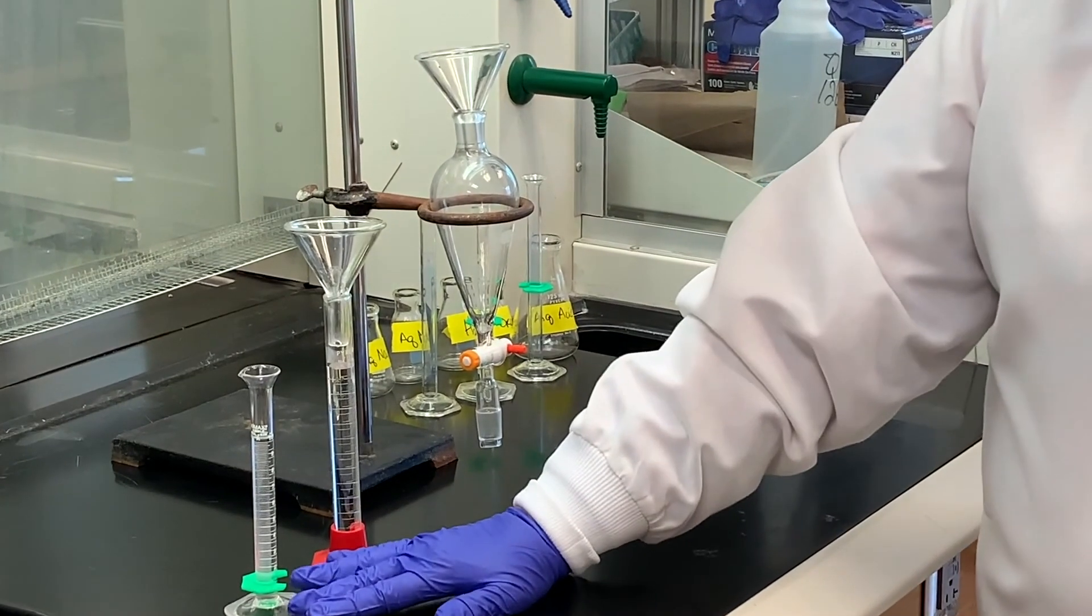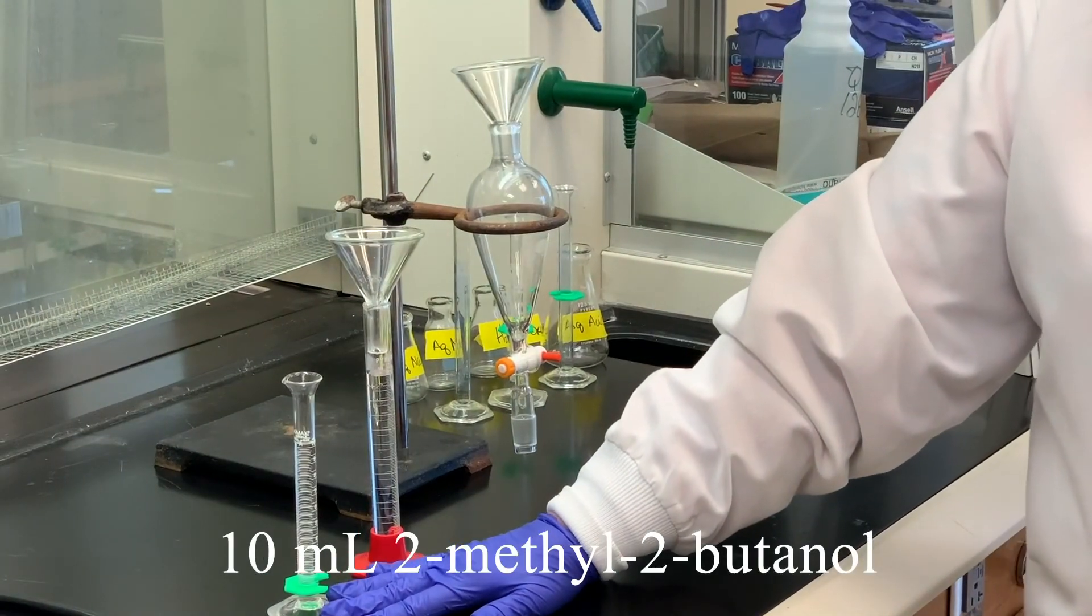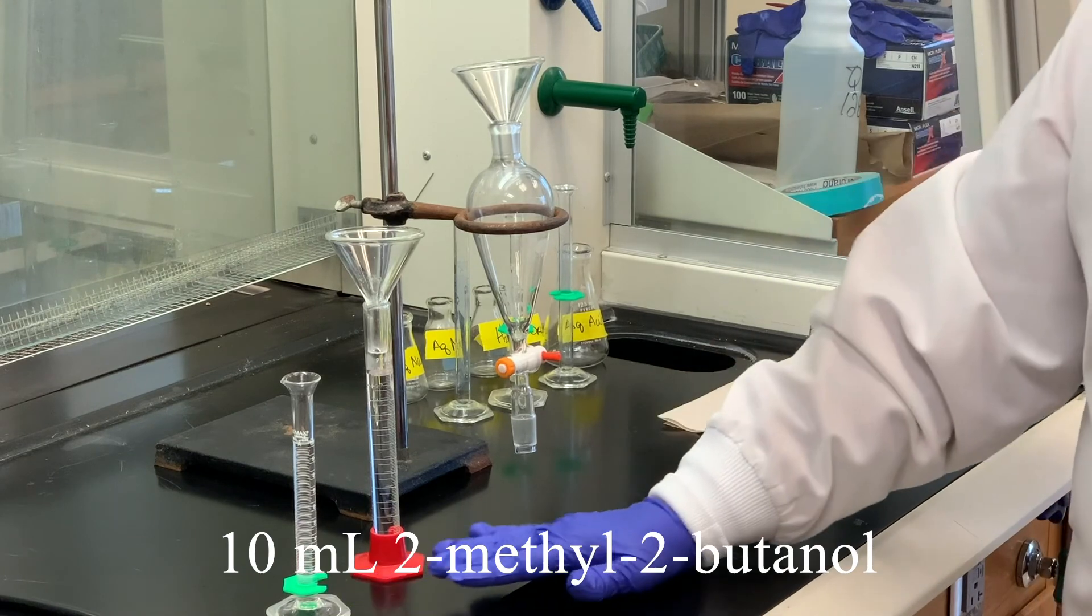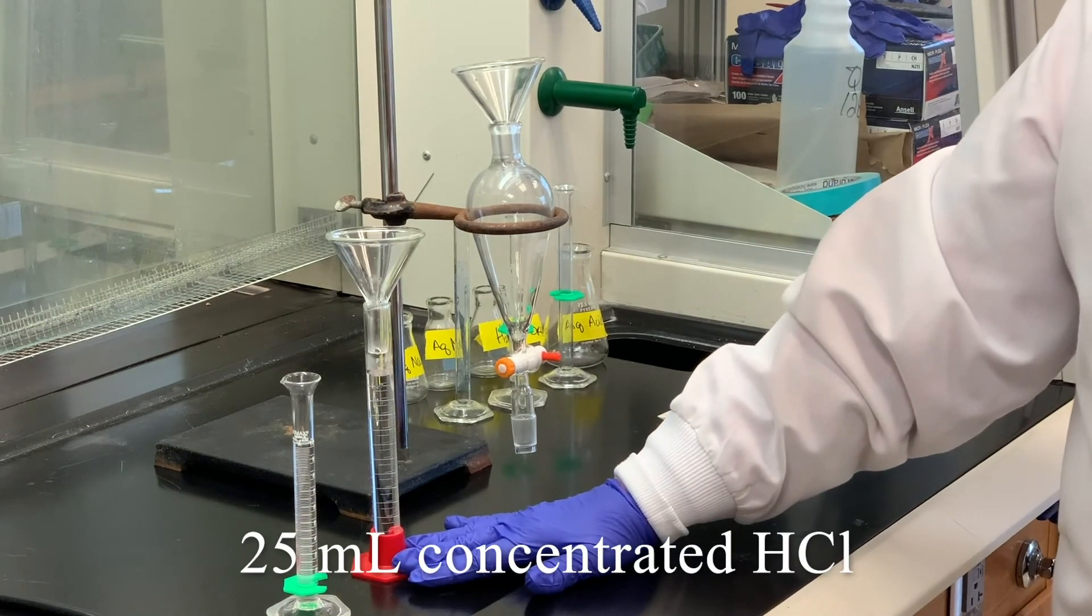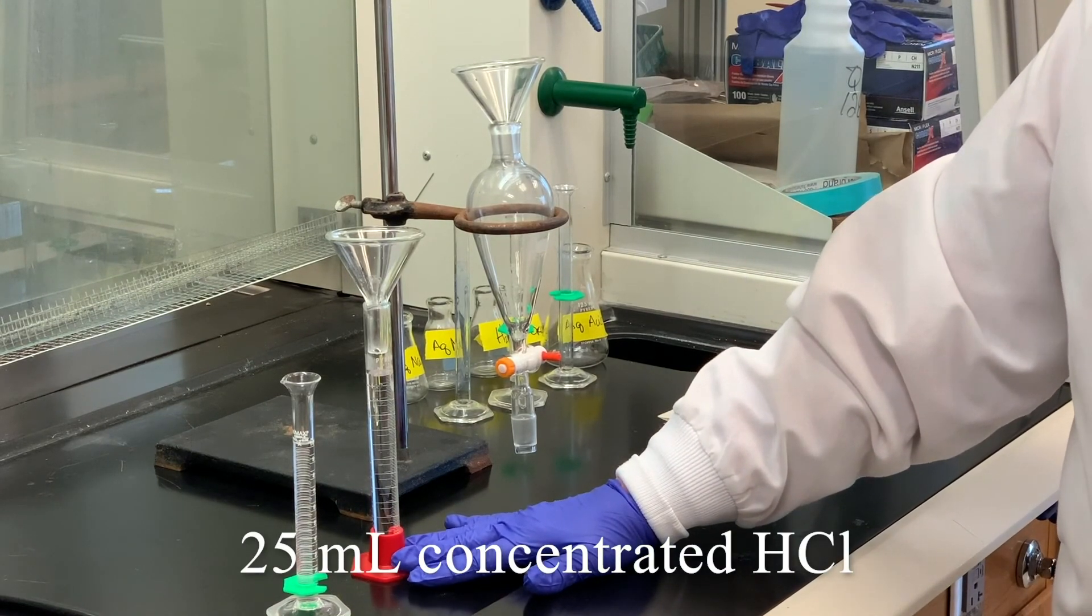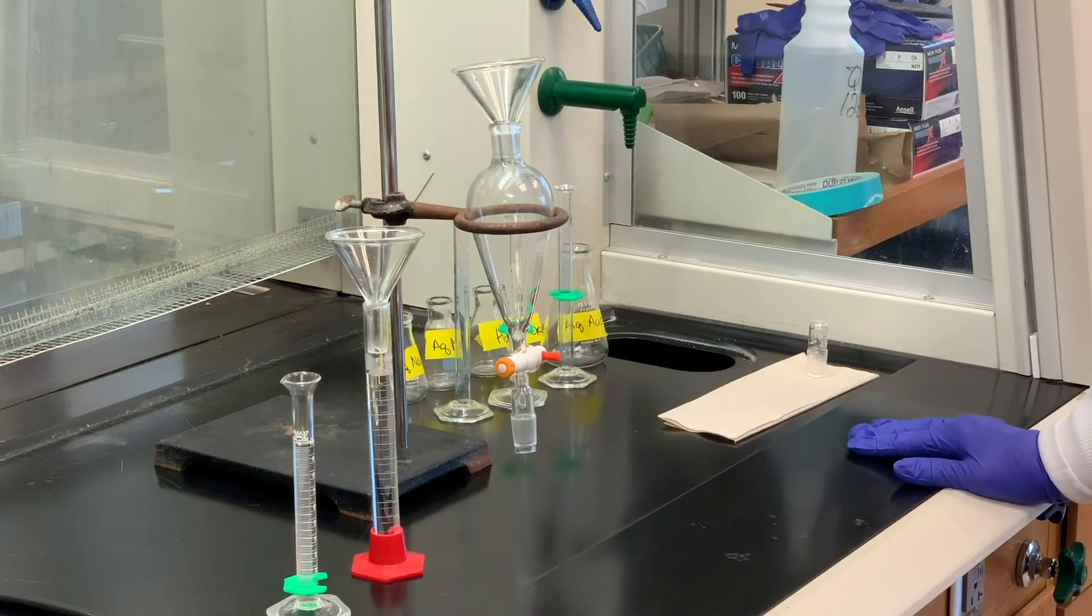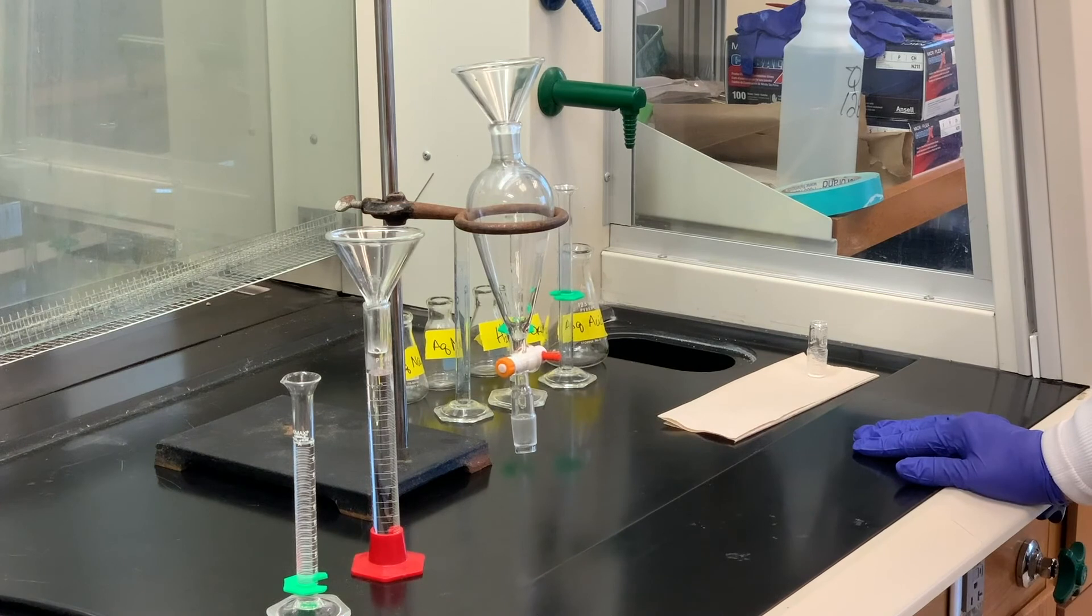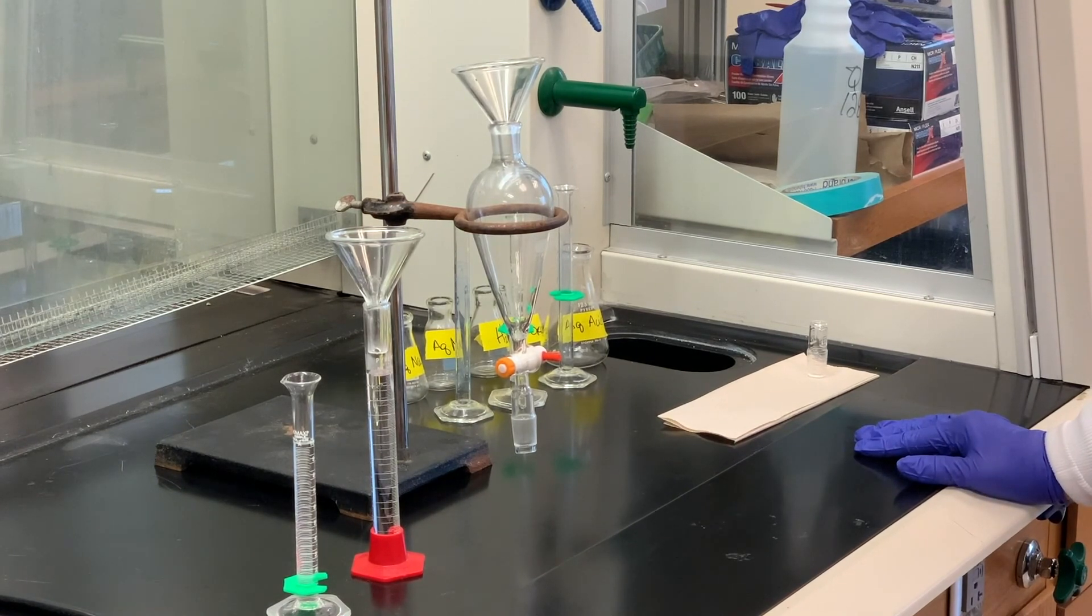What I have here is 10 milliliters of the 2-methyl-2-butanol, and we're going to add to that 25 milliliters of concentrated hydrochloric acid. This is a type of SN1 reaction where we can take typically a tertiary substrate, in this case the alcohol, and we're going to combine it with hydrochloric acid.